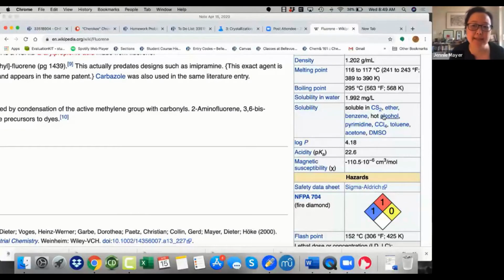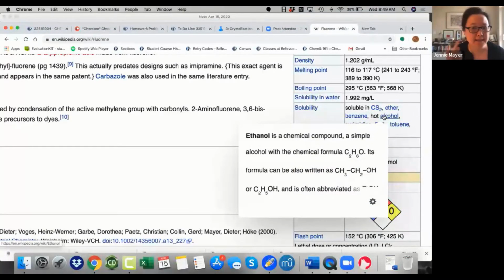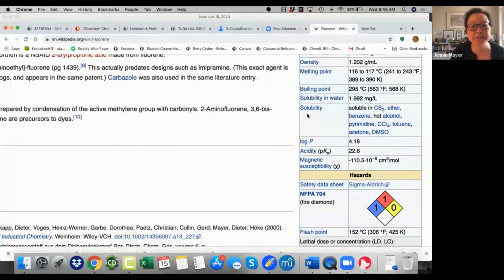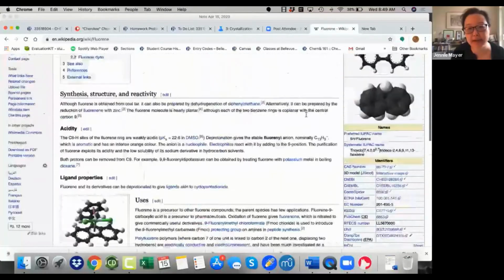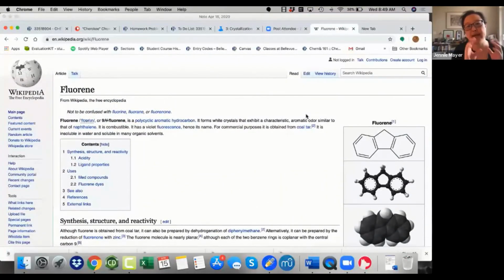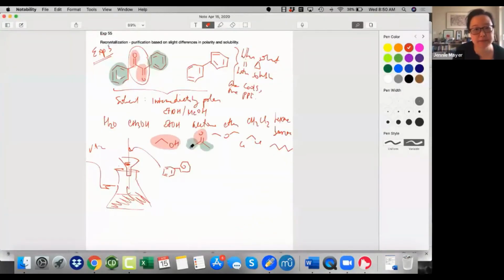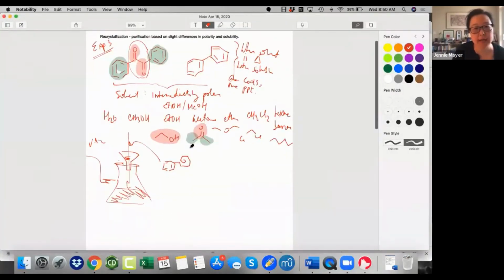The fact that they said hot alcohol is a good sign, because that means maybe it's not so soluble in cold ethanol, and then you have that difference in temperature. One of the videos I linked in the pre-lab gave you some data about benzoic acid, what is soluble in hot ethanol and what is soluble in cold ethanol or water. That's very important if you have any inkling that things have drastically different solubility at different temperatures. Okay, let's move on then.